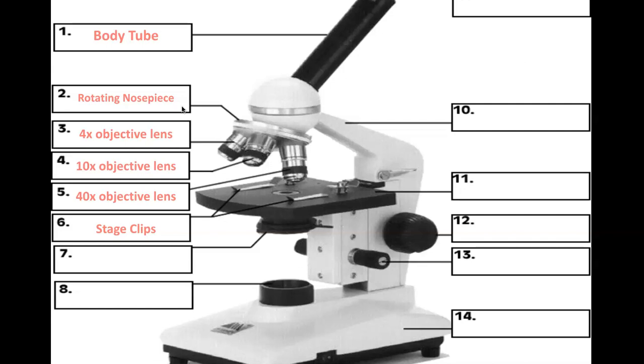It is in your best interest to collect some of that goopy, swampy stuff and observe that. If you got some plants in there, feel free to put a plant leaf on the slide and observe the cells in plant leaves. They tend to look very, very cool. If you're looking at swamp water with a mucky material in it, please make sure that you aren't putting too much on it, because you may find that you can't see through the slide very well and can't see anything other than mud. So it might require us to dilute it just a little bit.